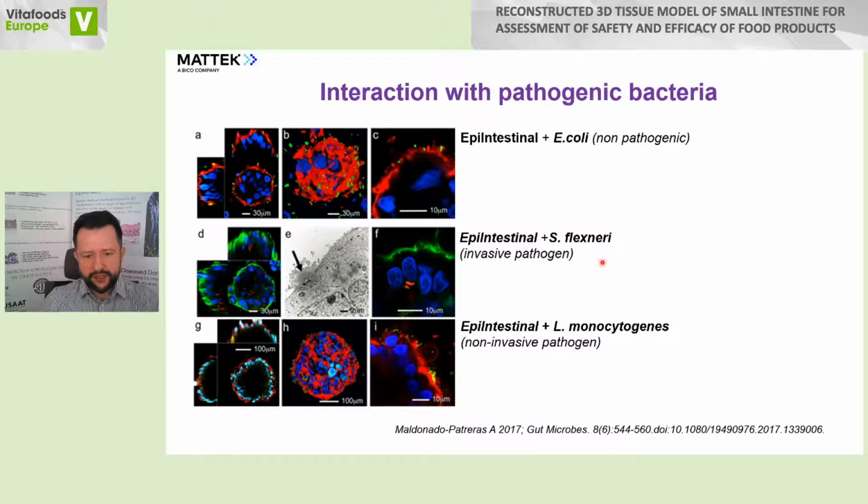The group from Massachusetts University was using our model to study the mechanisms involved in this invasion. And here you can see the microscopy images showing that our model was successfully able to model the invasion into the epithelium, because this bacterium is able to invade inside the epithelial layer.